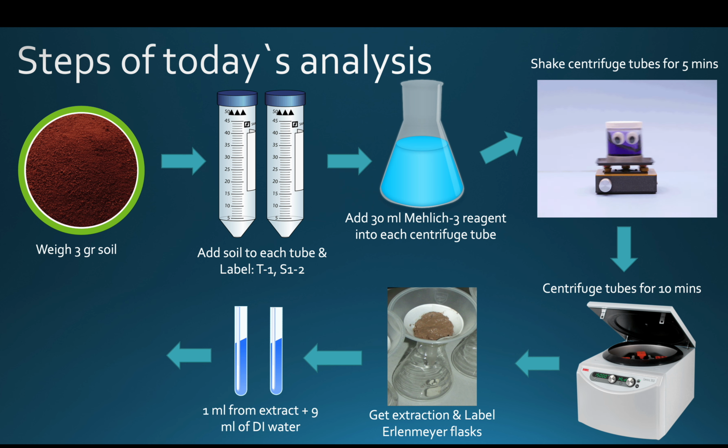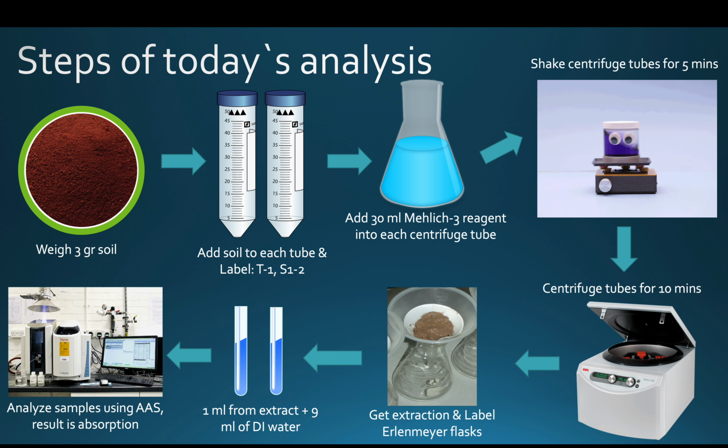And then if you recall, this is the stuff that I took care of with the small pipetter, just diluted into some DI water. And then we analyzed on that device, the atomic absorption spectrometer. For the first of the three base cations, calcium, magnesium, and sodium, we used absorbance, and then potassium, just by product of how we have that machine configured, we used an emission, just so we don't have any confusion down the road.